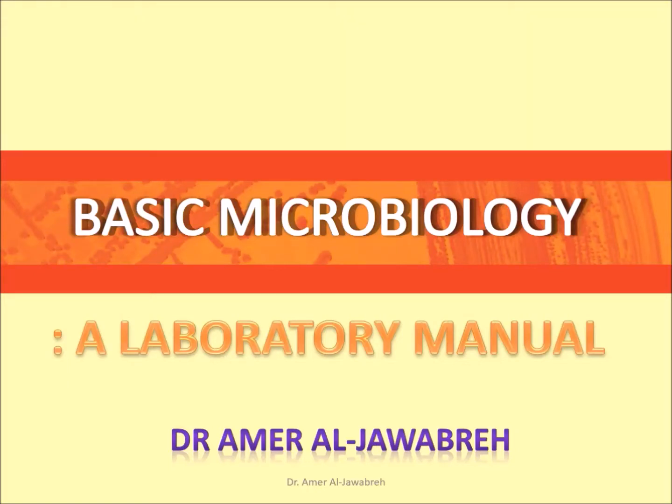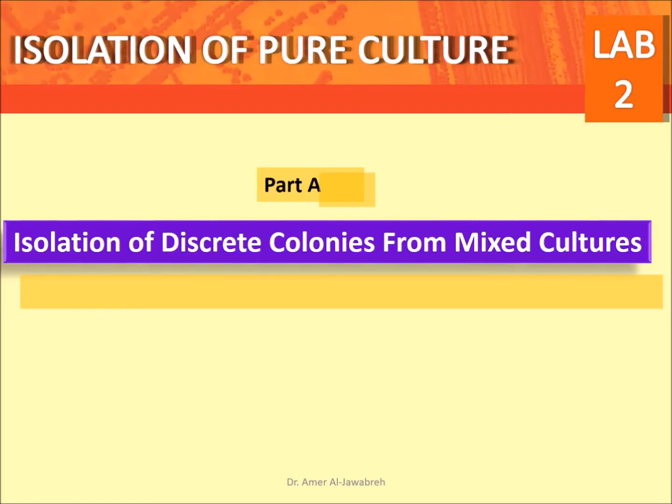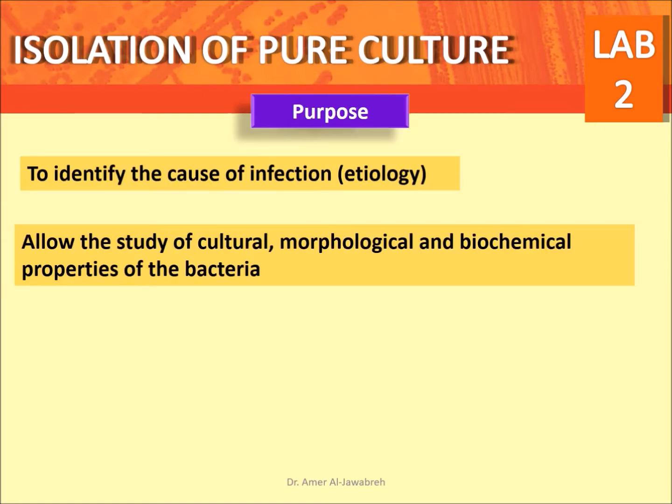Basic Microbiology, a Laboratory Manual. Lab 2, Isolation of Pure Culture. Part A, Isolation of Discrete Colonies from Mixed Cultures. Purpose: to identify the cause of infection, or etiology.